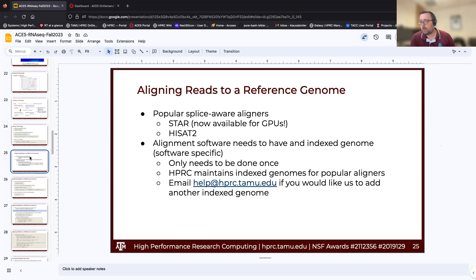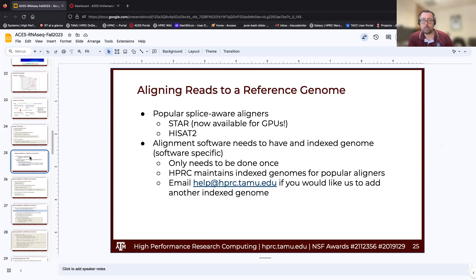Now we're going to move on to aligning our trimmed reads to the reference genome. There are two major splice-aware aligners: STAR and HISAT2. Today we'll be using HISAT2. I like HISAT2 a little more of the two CPU versions — it's a little less memory-hungry, especially when indexing the genome. But they're both fantastic read aligners and you really can't go wrong with either one.